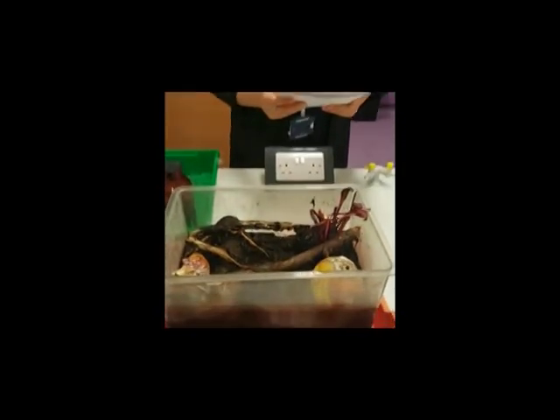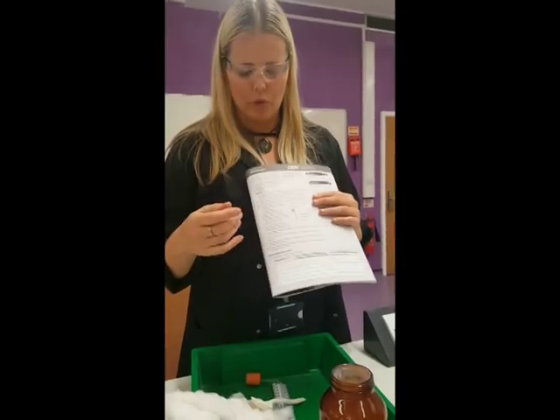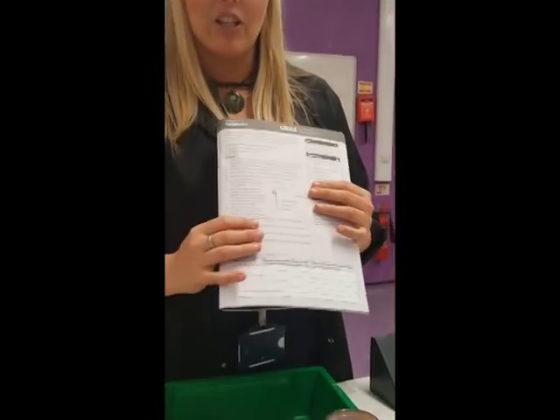We're going to use a simple respirometer. In this, you're going to be able to see if you can work carefully with living organisms and make accurate measurements. What I'd like you to do is read along with me as we carry out the procedure. We'll do it bit by bit so you can see what's actually done.